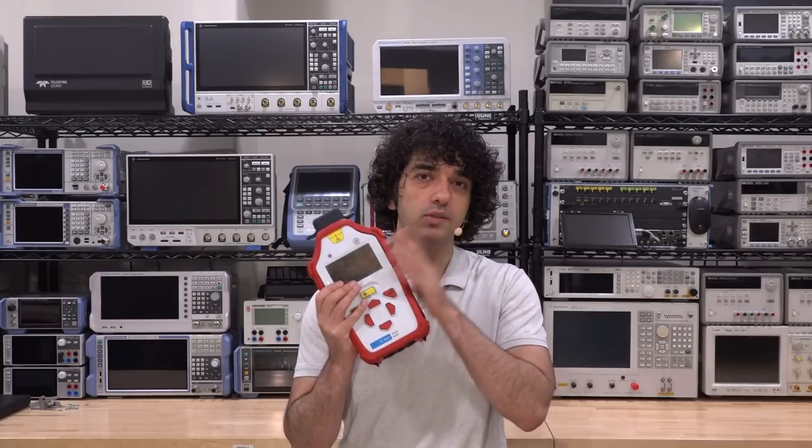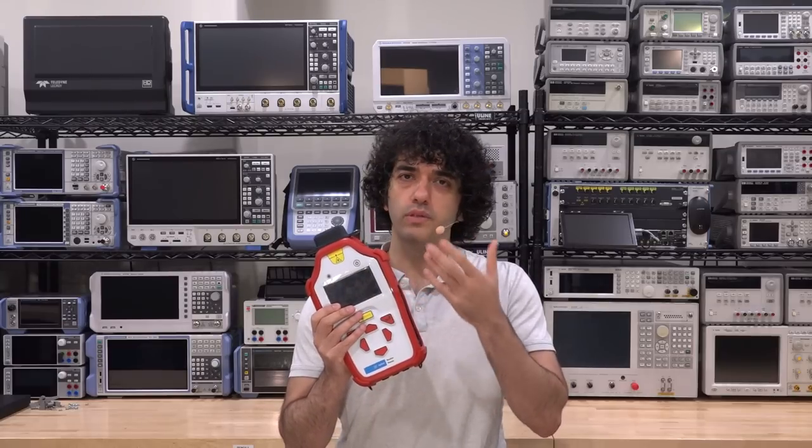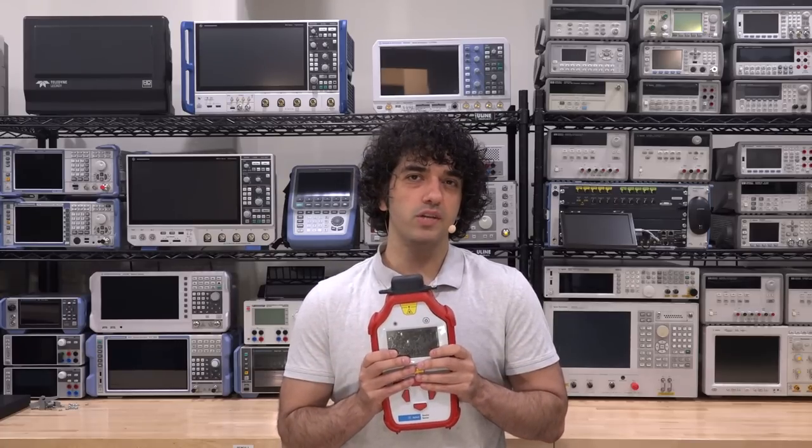Hi, welcome to The Signal Path. In this episode, I have something absolutely incredible to show you. This is the Agilent Resolve. Now normally we talk about what the instrument is and what it does, but in this case, I think it deserves a demonstration first.